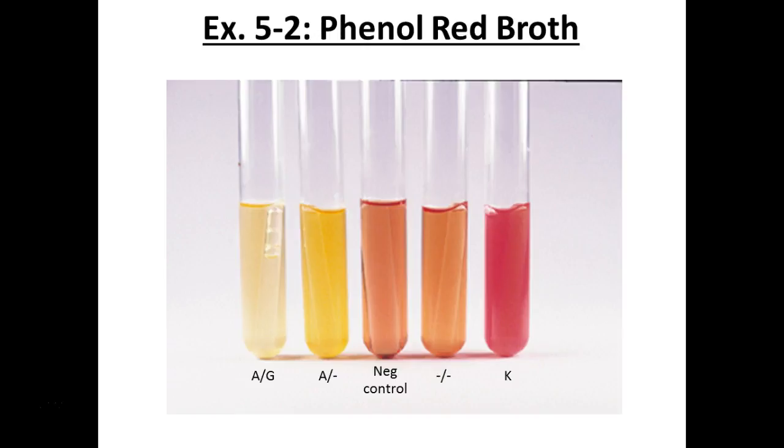Right? So the other thing I usually tell my students is check for turbidity. Did something grow in that tube? Because usually, right, it's going to do one or the other. It's either going to produce acid, or in this case, it's going to be alkaline because it did what? It digested the protein. Right? And some organisms will do both. But they always pick something first.